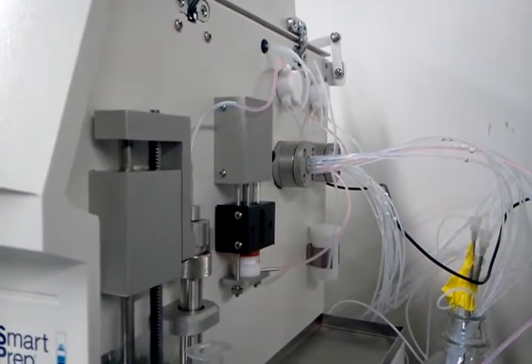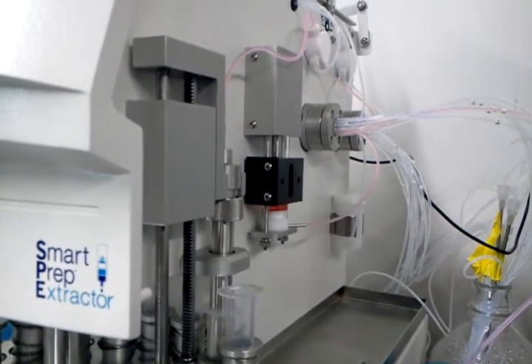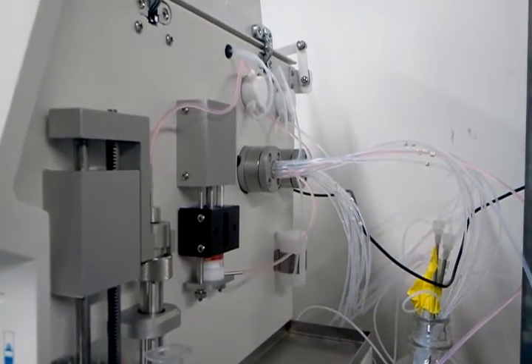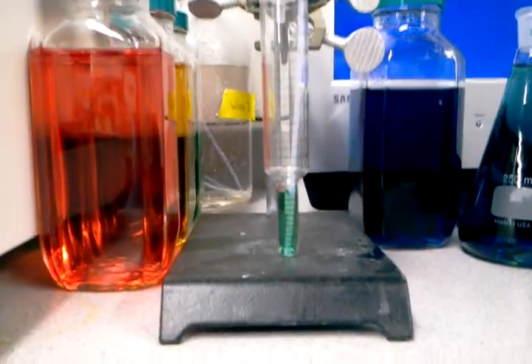You can see the colored water going through the line going on to the head of the column. This line will stay filled with the red liquid and what the unit will then do is pull one mil of sample, which I have in this KD vessel.